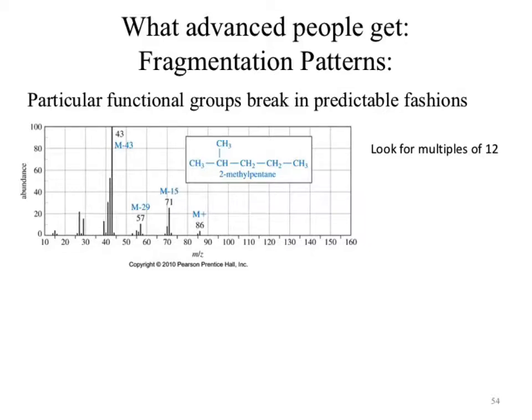After that, if we look at an example mass spec here, it would have been nice if the textbook or the place where I stole this from hadn't gone all the way out to 160. Why do we not need to go out to 160? There are no peaks there. The peak furthest to the right, within 3 units, the tallest peak. I would look at the x-axis and see where that tallest peak was. Can anybody see the numbers or the tick marks telling me where that is? No. So what did we do? We told you where it was, 86.